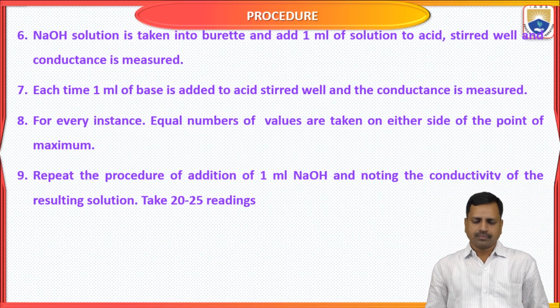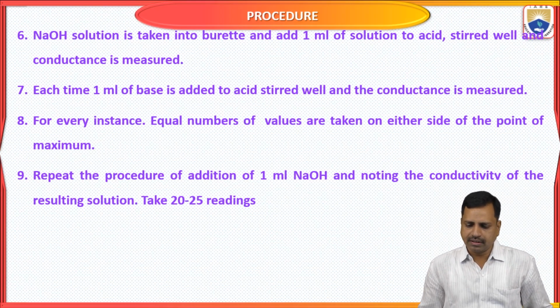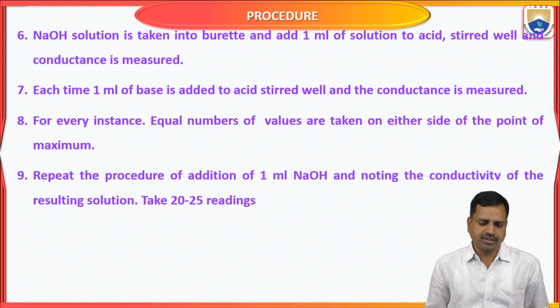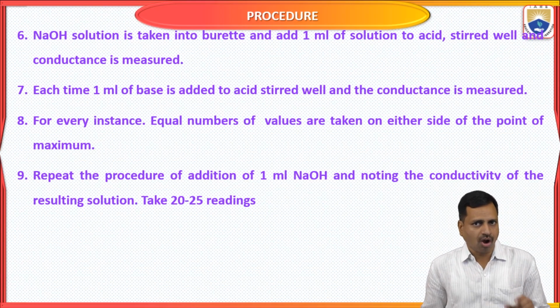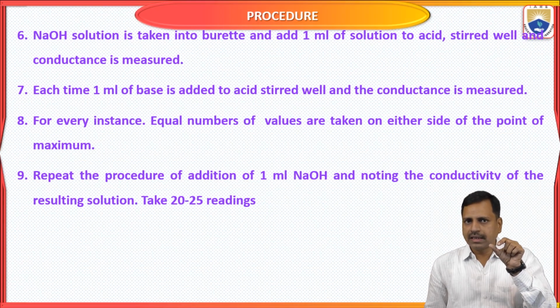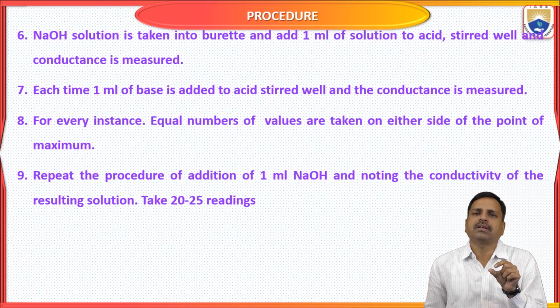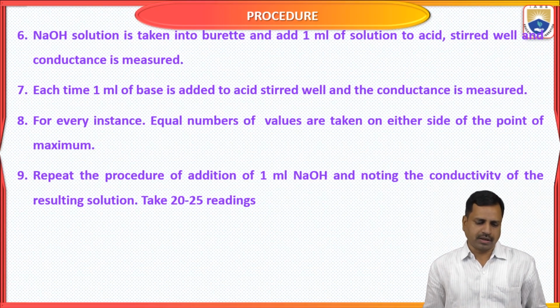Repeat the procedure of adding 1 ml NaOH and noting the conductivity of the resulting solution. Take 20 to 25 readings, or take readings until you get that reading.